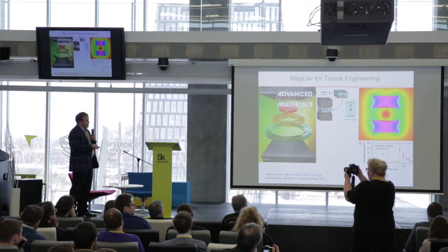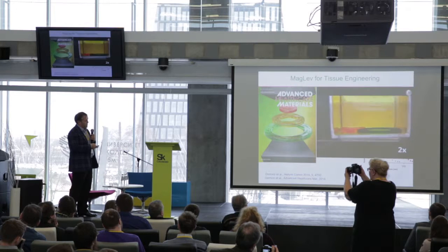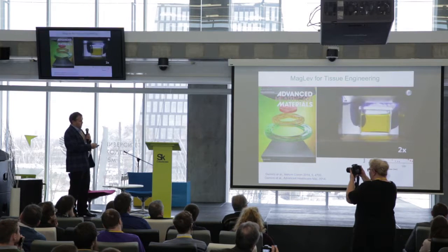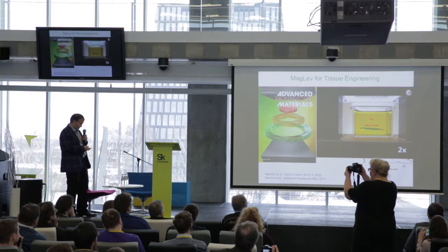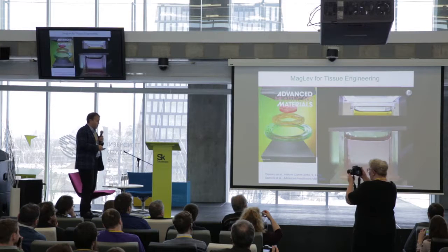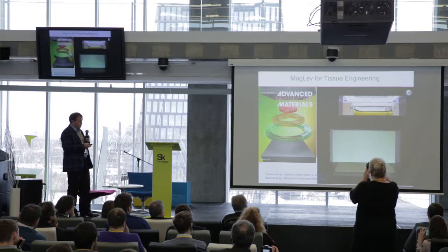When we put them in here, they balance with the gravity force. In this system, which is large enough, you see the different density gels going to different heights, like in the schematic we are depicting here. Further, you can assemble spheroids or small microgels in the same system.